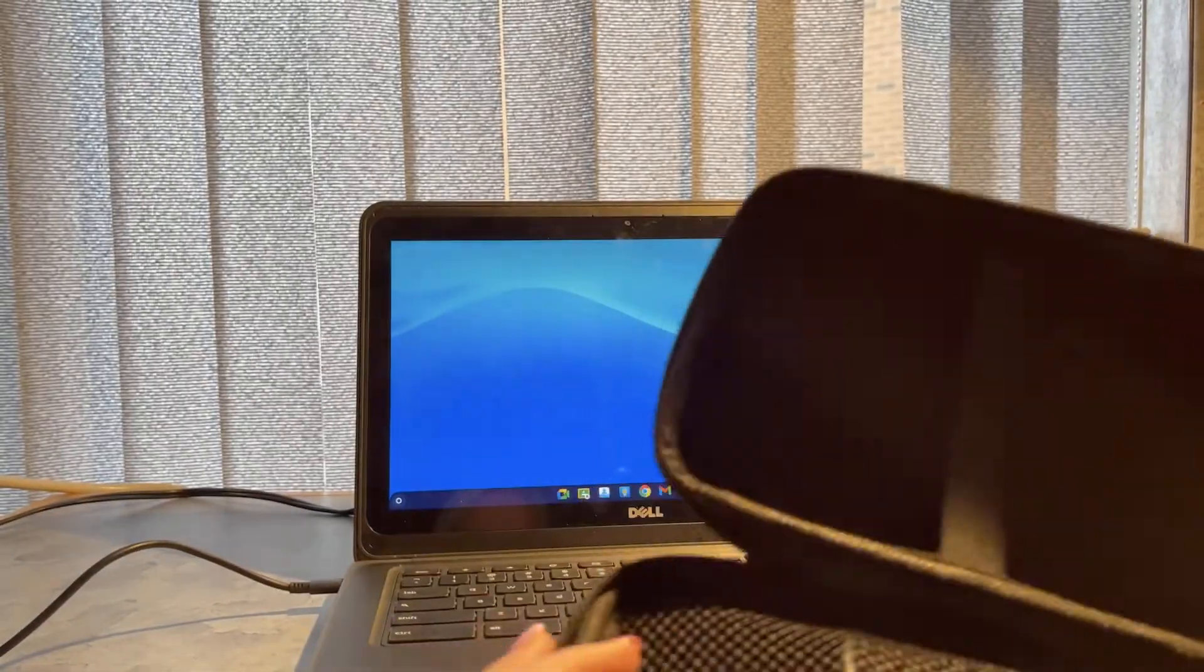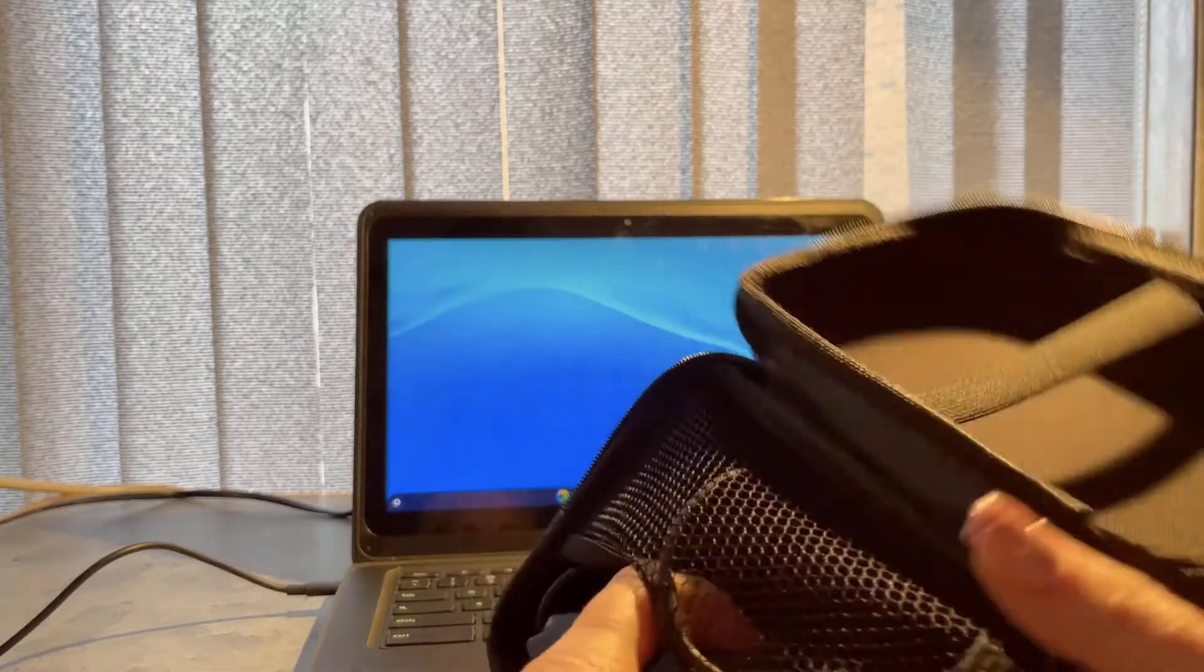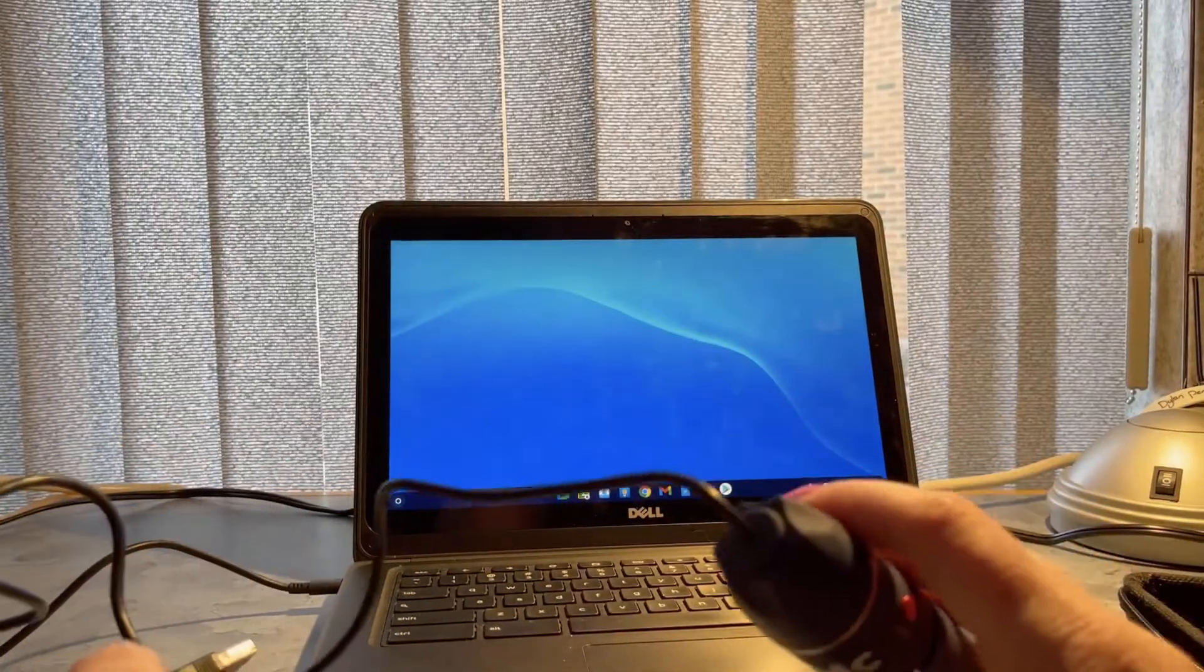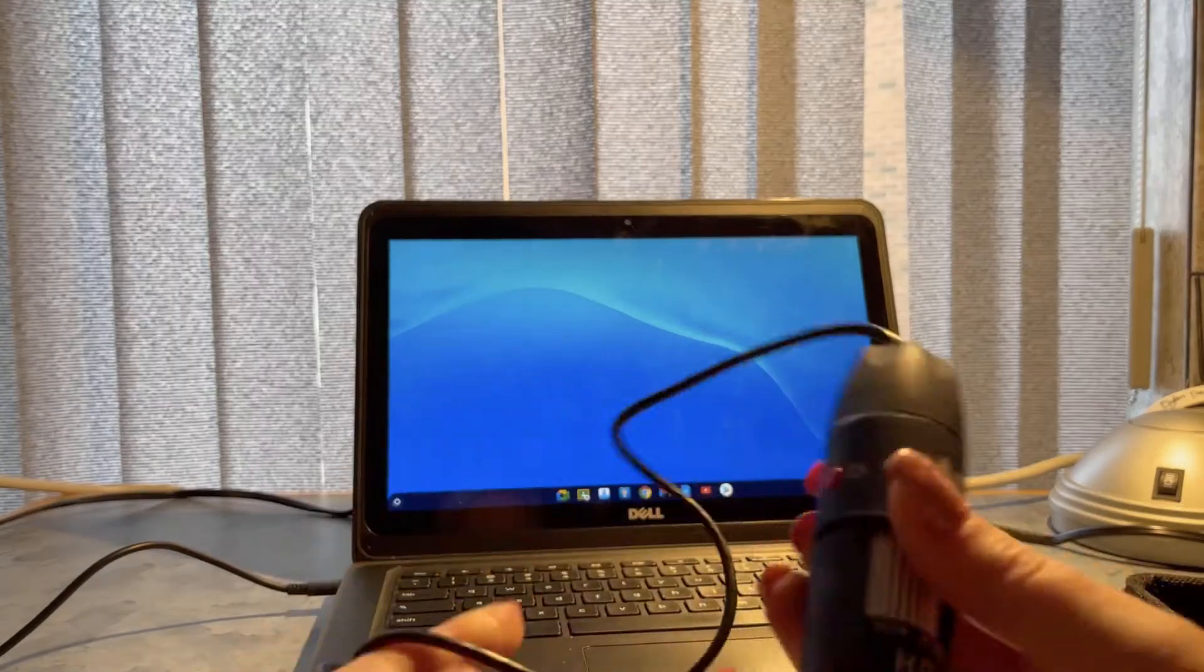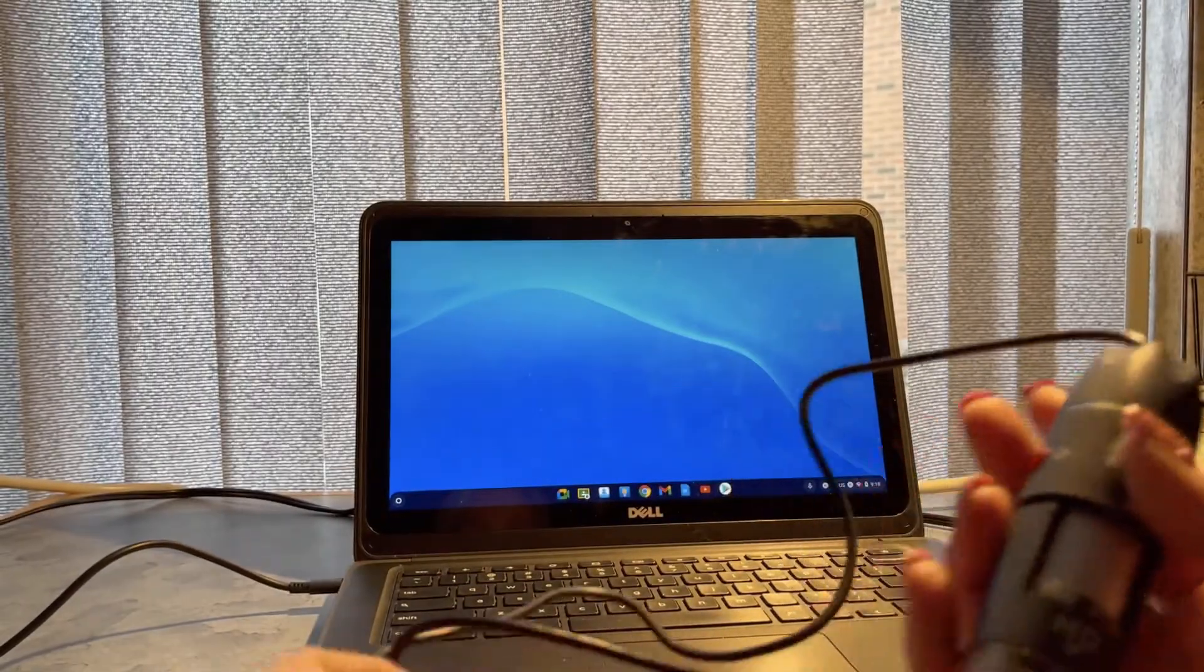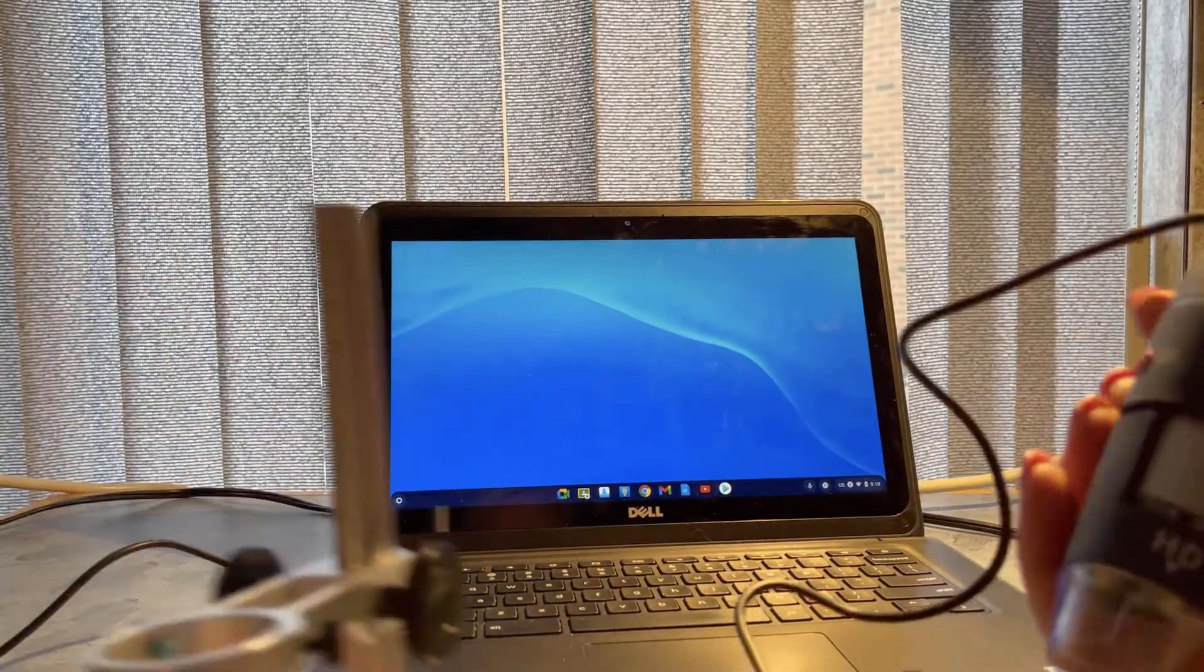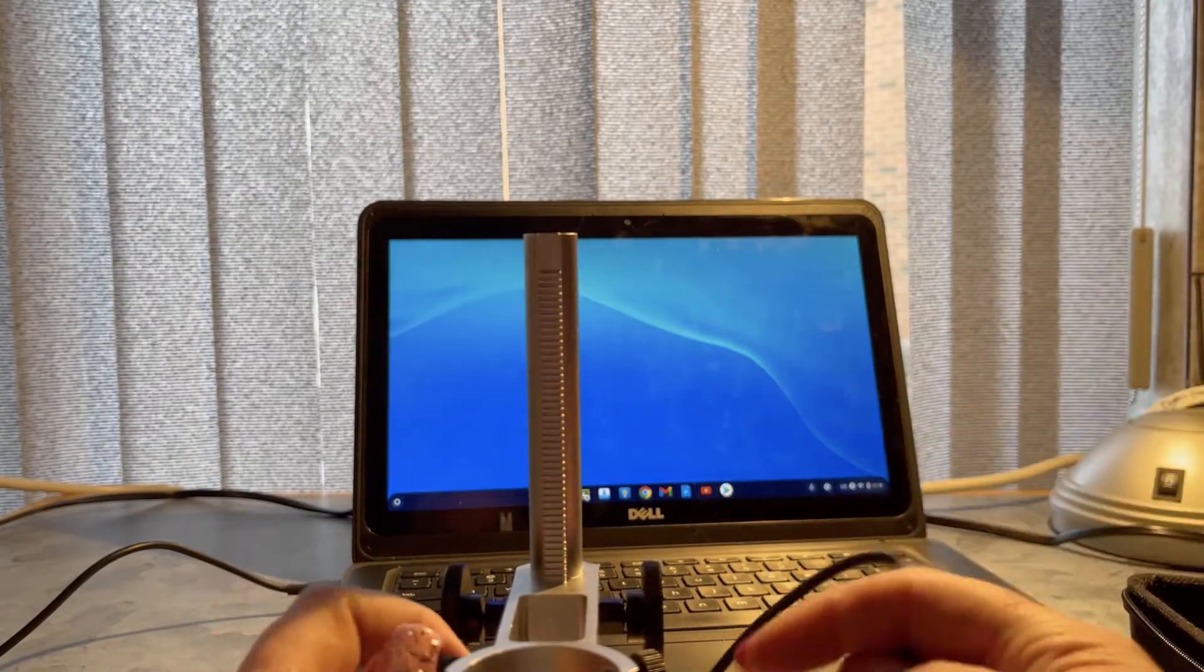Opening the case, we find the digital microscope with its cord permanently attached, so there's no way to lose these cords. This was part of the decision process for having these as sign-out equipment for our teachers in the district.